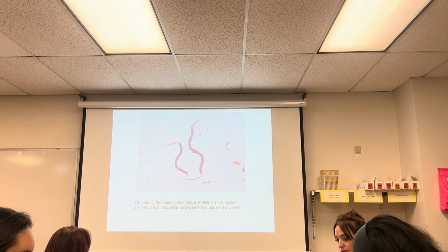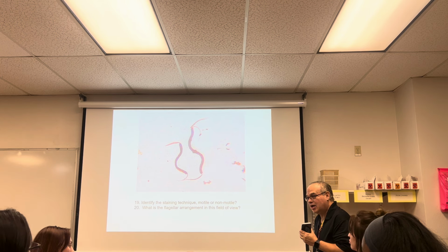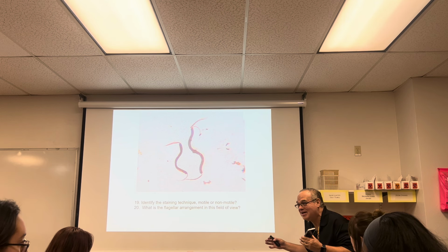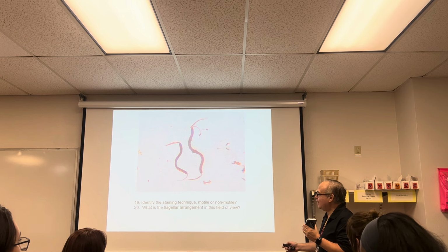Look here. So be careful here because these things will get you. You need to look. By definition, it's Gram-negative. Good. But this is really looking at something else. This is looking at these things here.